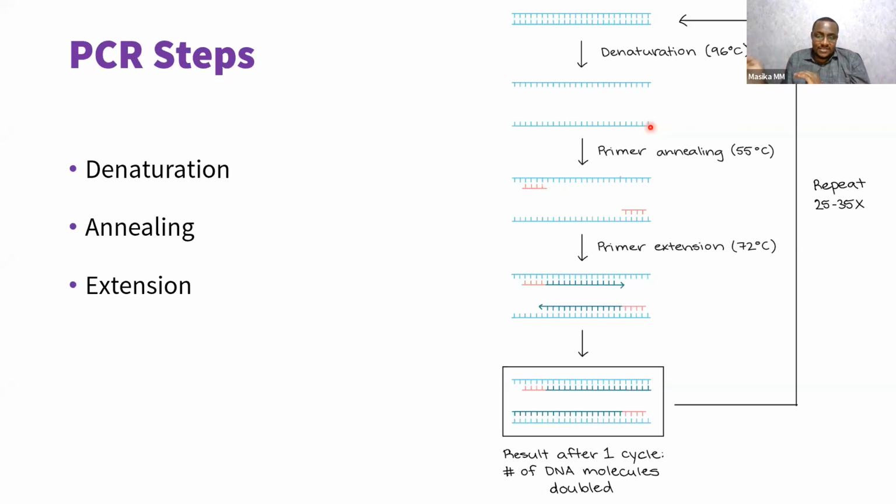Because when it goes beyond 1,000, the conditions of the PCR become a bit challenging because it is overworking the polymerase and it needs more time to copy the entire thing. Although now we have polymerases that work faster and they can do this within a shorter time. So you don't target the entire genome, you target a small portion of it.